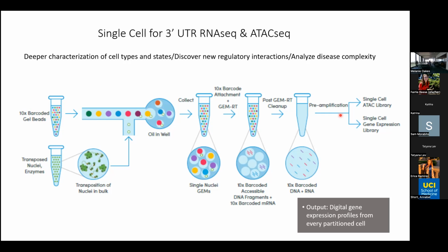Question here, for this model, is the barcode the same? Yes, exactly the same. The primers that are associated with the hydrogel bead, they're different primers, but they'll all have that same cell barcode. Some of the primers will be for the Nextera, which would be for the transposase portion, to capture that, but they'll have that same cell barcode.